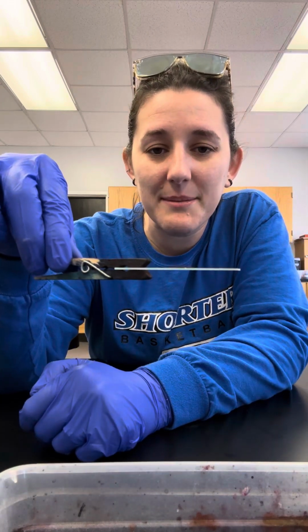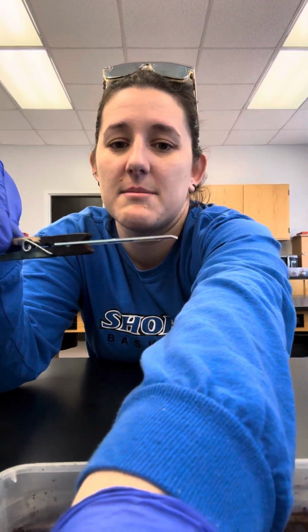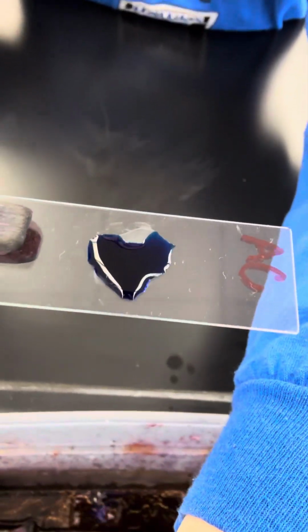Oh, it looks like a heart. Happy day after Valentine's Day. I know y'all can't see it here. Yes, I can move my phone because it's my phone today, not my computer. Looks like a heart.